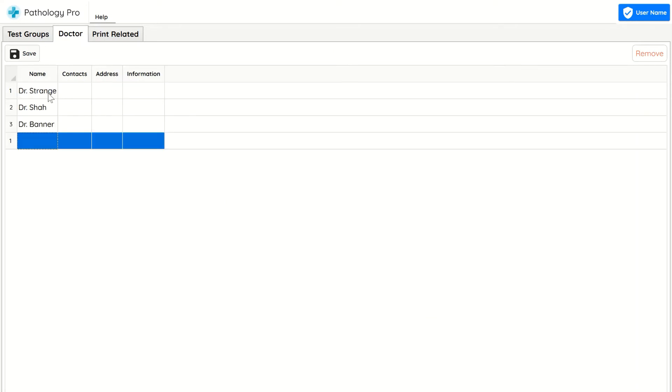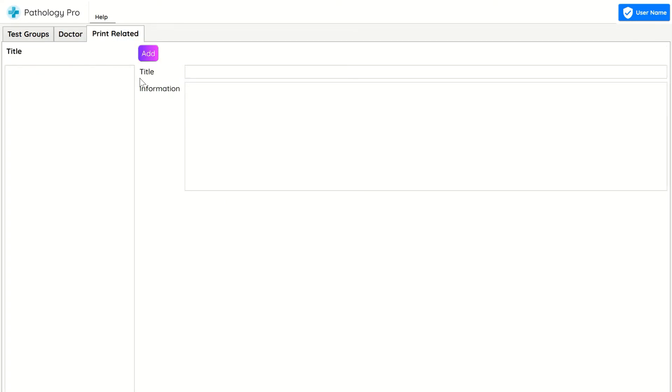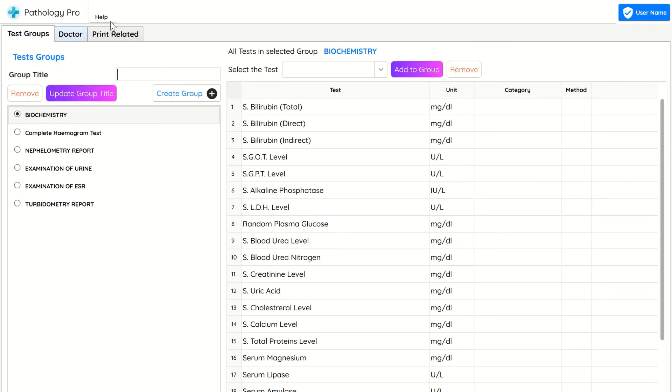You can add doctors' names and print related data of tests which you like to print under the report so it's fully customizable.